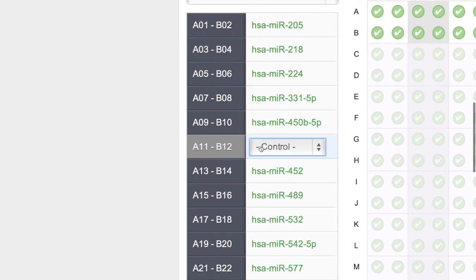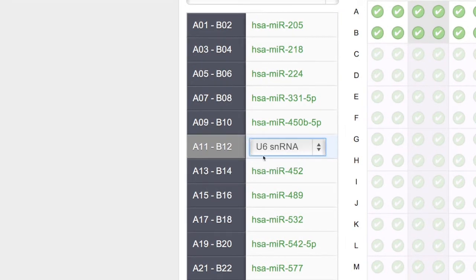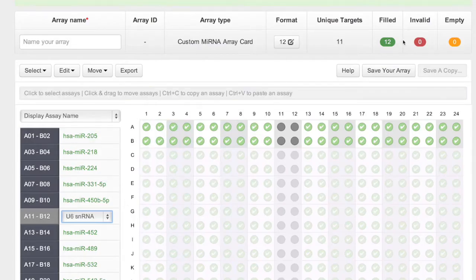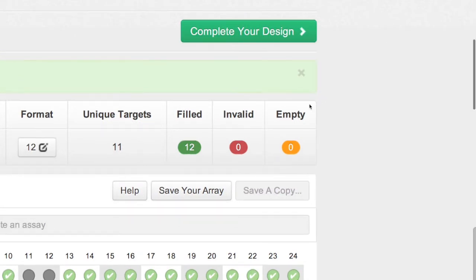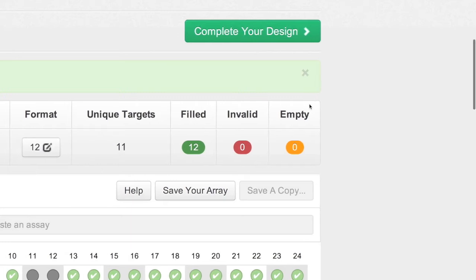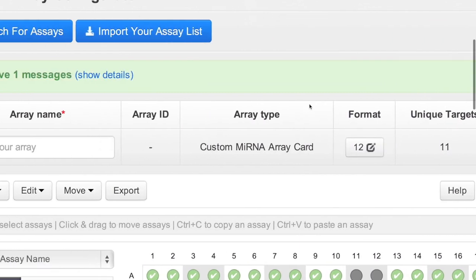Next, choose a control. You will see that 12 unique targets are designed on the array card, including the control. No invalid targets have been identified, and there are no empty wells. Made-to-order assays will be displayed as invalid and are not allowed on the custom cards.